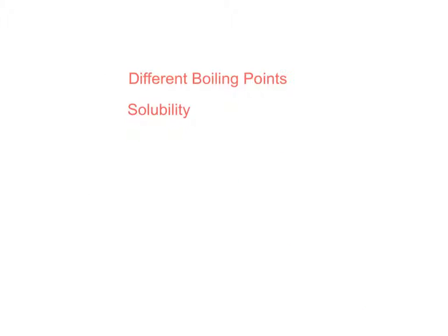In order to have the distillation work, we need at least two substances that have different boiling points, and one substance has to be soluble in the other substance.